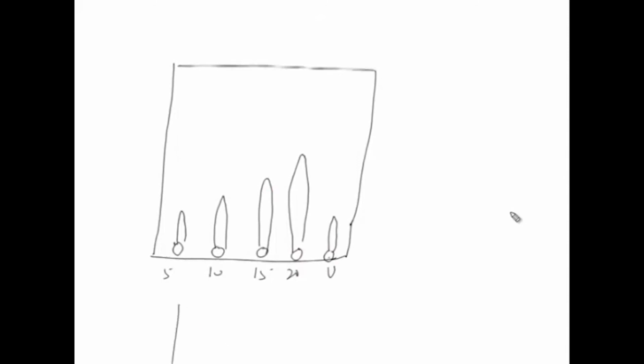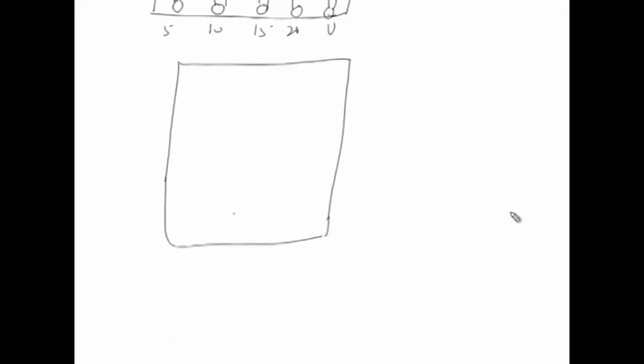Now, in two dimensional rocket electrophoresis, first electrophoresis is done in this direction, that is, you have separated these components here rather than punching holes, and this whole thing has been fused into the next gel, which contains the antibody.